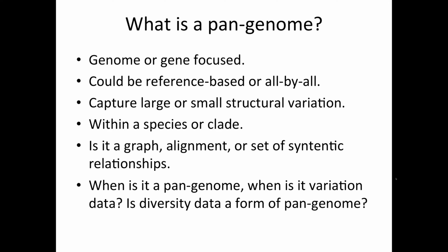This is Pankaj here. I think how the pangenome has been described by the microbiome and other communities is a complete picture of a genome, of all the structural variations and of all the possible paths on a chromosome by chromosome basis. So for example, rice pangenome: the original rice reference was about 430 megabases.